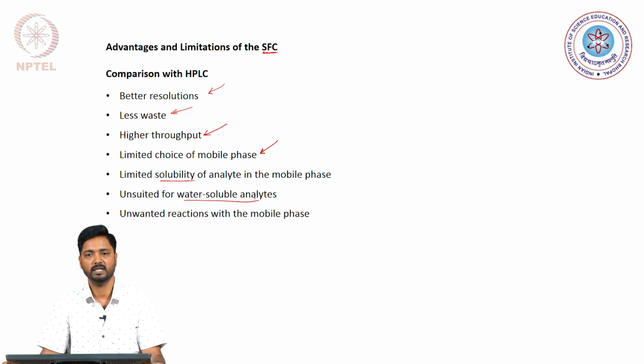The latter, that is the high performance liquid chromatography, in this sense is more versatile. Now, another challenge with regards to the supercritical fluid chromatography is that sometimes the carbon dioxide can undergo spurious or unwanted reactions with the analyte, especially if the analyte is having amine residues.